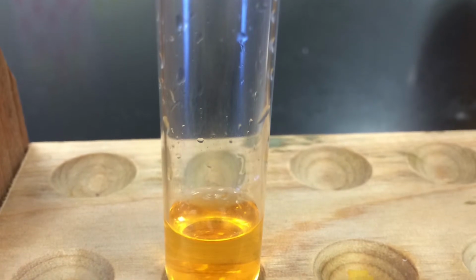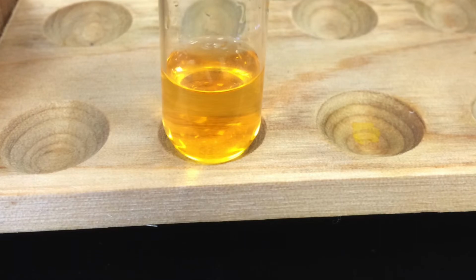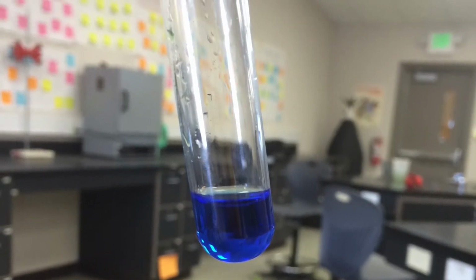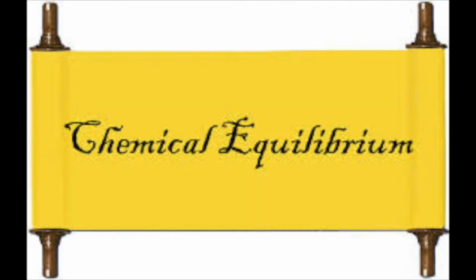When HCl, an acid, is added, it is adding H+ ions to the reaction, which causes the reaction to shift left. When NaOH, a base, is added, H+ ions are being removed from the reaction, which causes the reaction to shift right. Since HCl is a strong acid, it dissociates completely, so there are more products, therefore shifting the system to the left. When NaOH was added with HCl and the indicator, it counteracted the strong acid by shifting the system right and placing the reaction back at equilibrium.